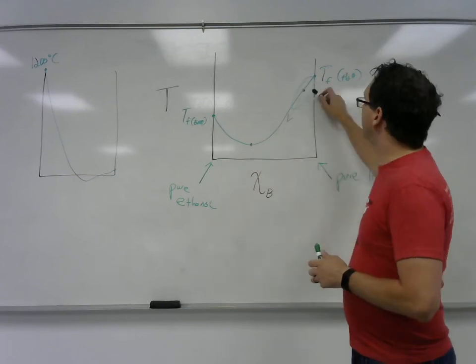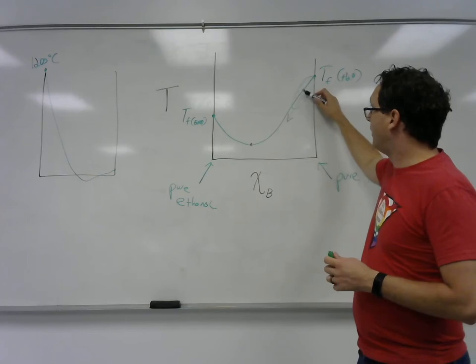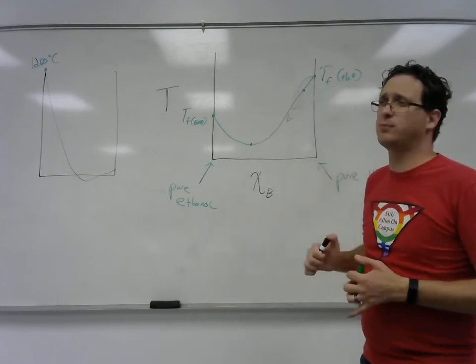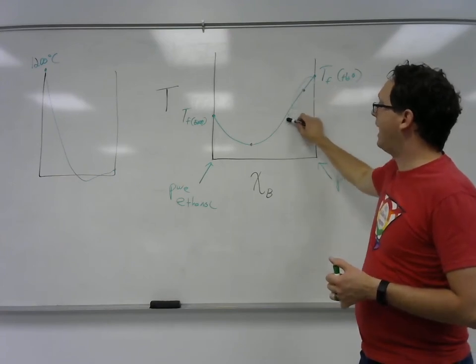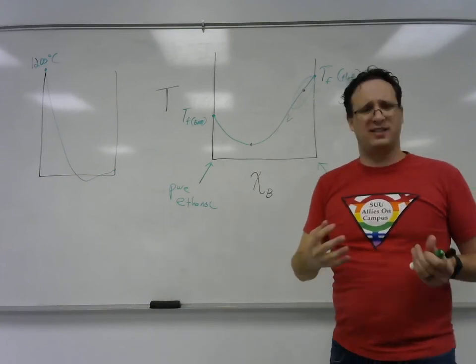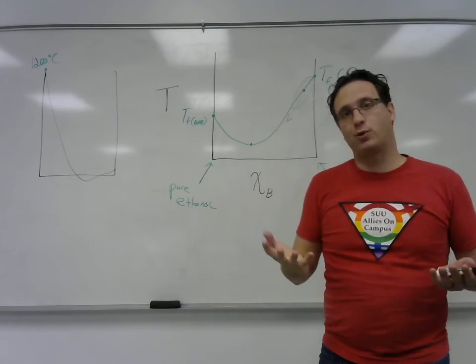But at least in the initial stages and perhaps through to the end, if your concentrations don't allow it to reach a eutectic point, then your freezing point will actually drop over the course of your freezing. This is kind of like distillation, and in fact you can use fractional freezing in order to purify things.